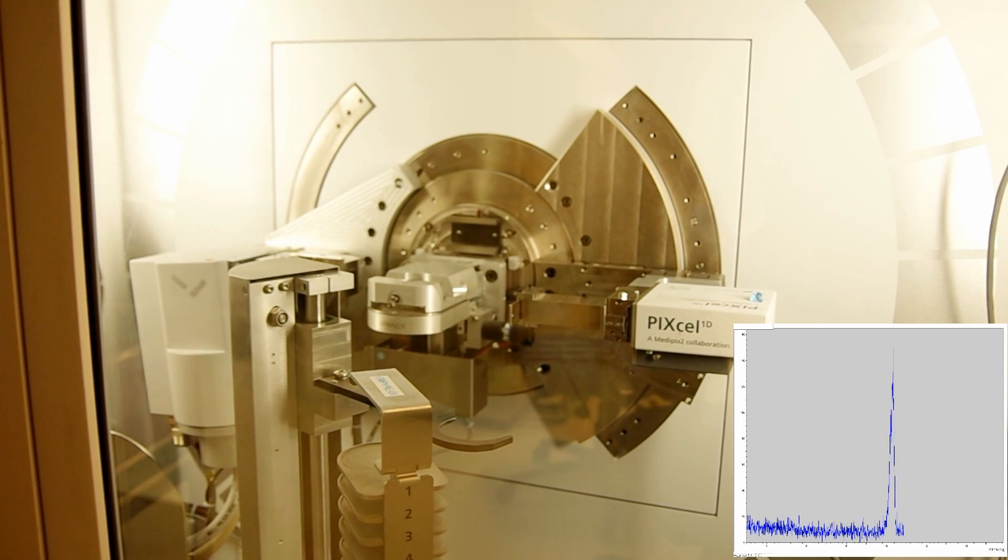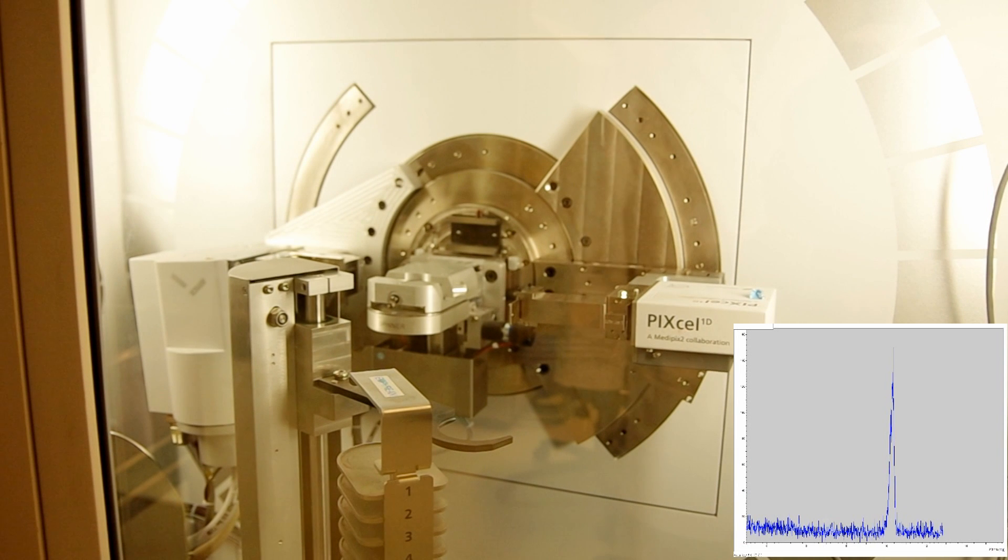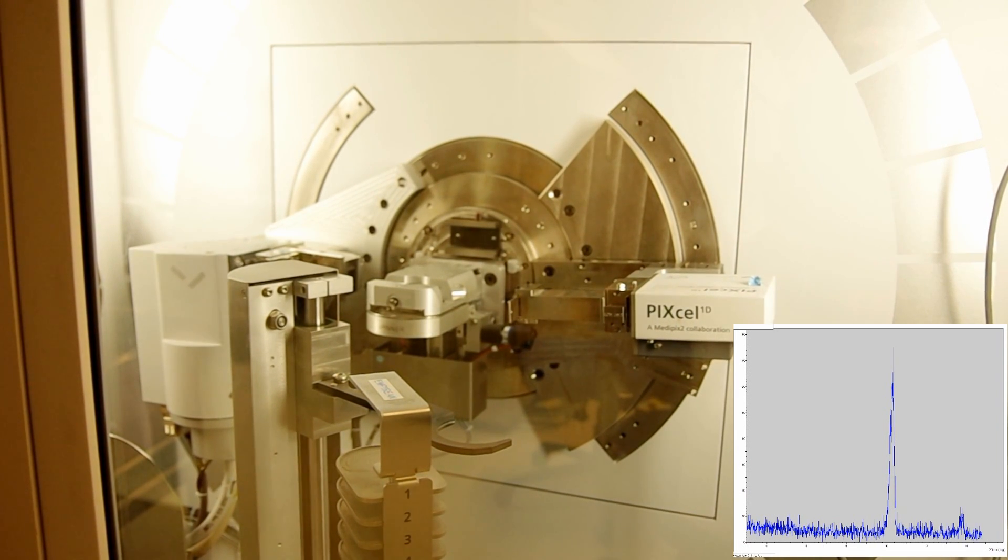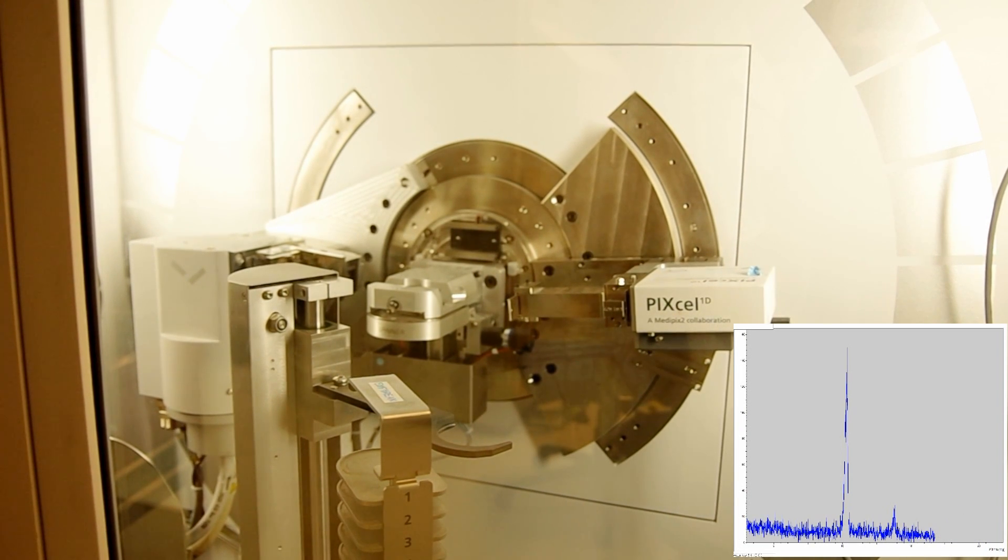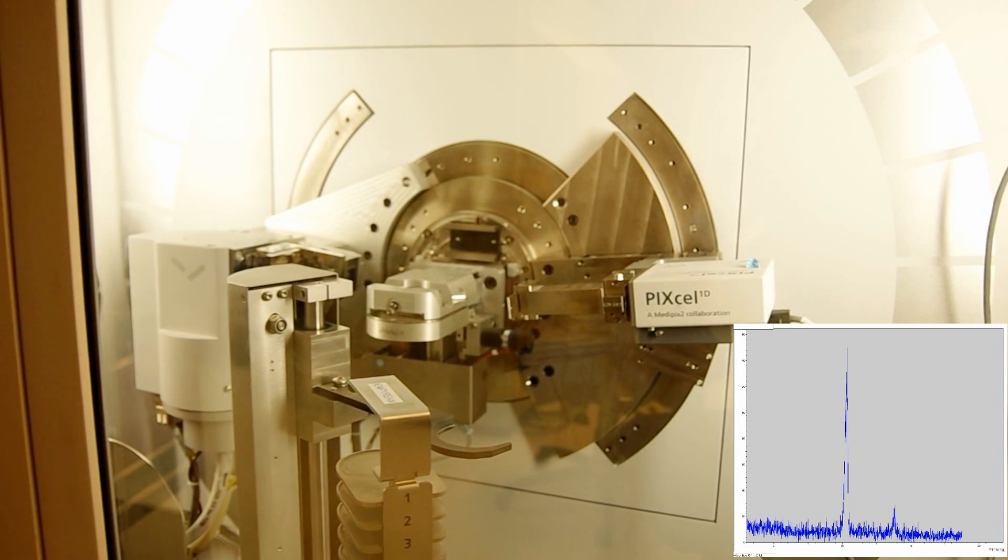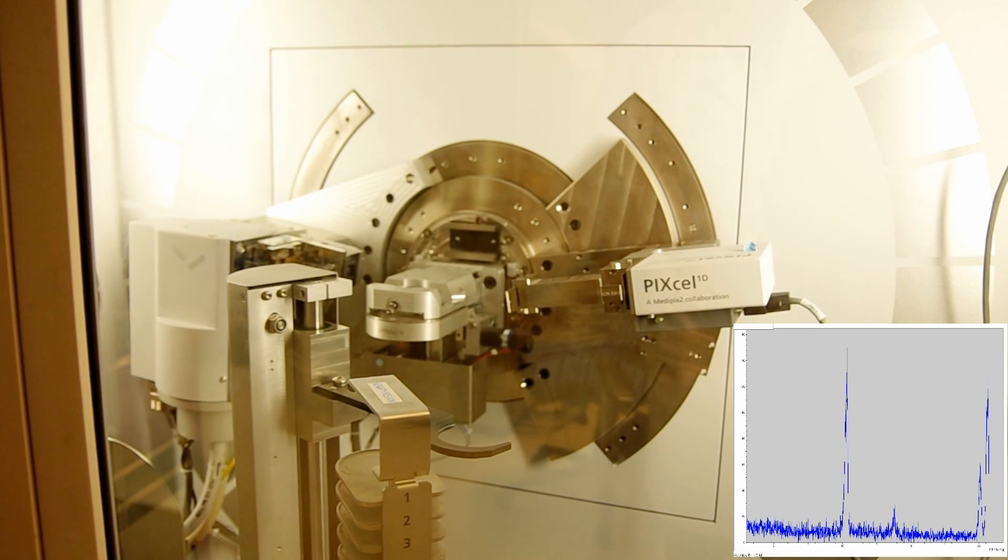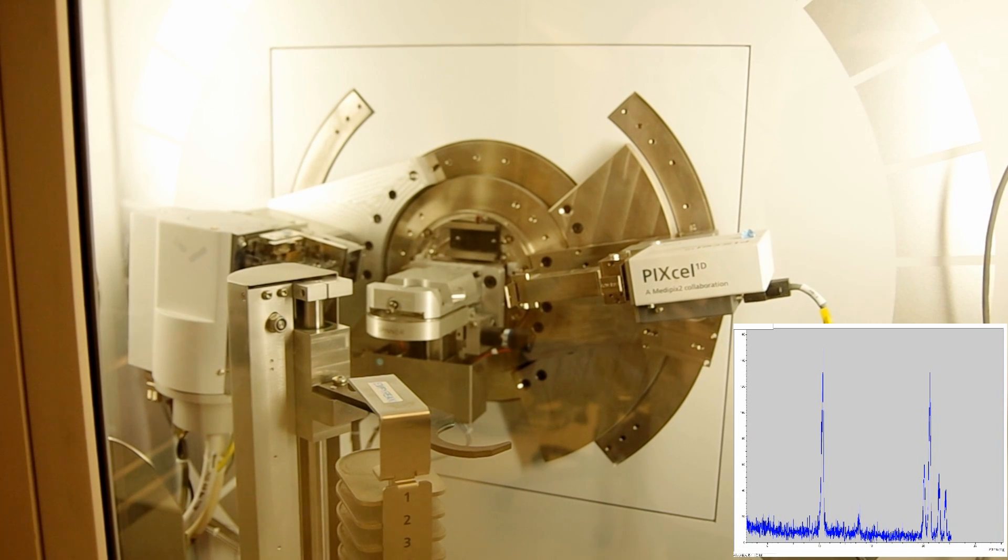Instead of changing the incident X-ray angle, the detector's angle is changed to collect the reflected X-ray at different diffracted angles. The data is being collected by the detector and the signature peaks start to show.